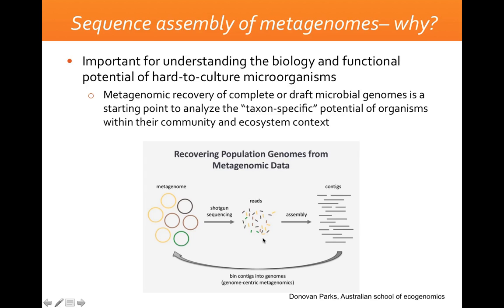And that of course will be really important in order to discover new species, especially things that have been impossible to grow in the lab and has never been sequenced because they are impossible to grow in the lab. These are things that we can obtain by doing random sequencing of metagenomes.